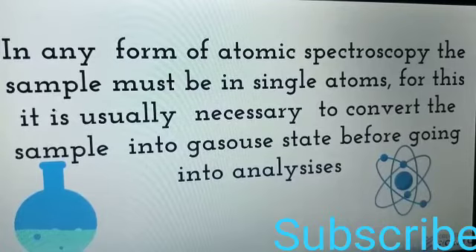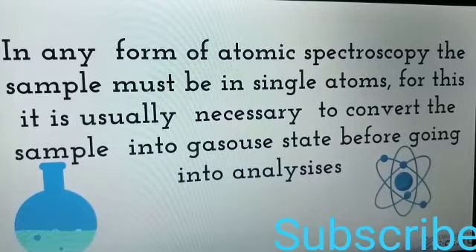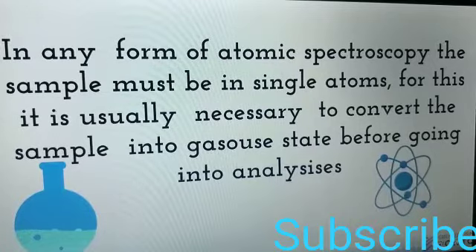Remember, in atomic fluorescence spectroscopy, the excitation source is UV visible radiation. In flame emission spectroscopy, the excitation source is flame. In flame emission spectroscopy, no radiation source is used. In atomic emission spectroscopy, electrical or inductively coupled plasma is used as excitation source.